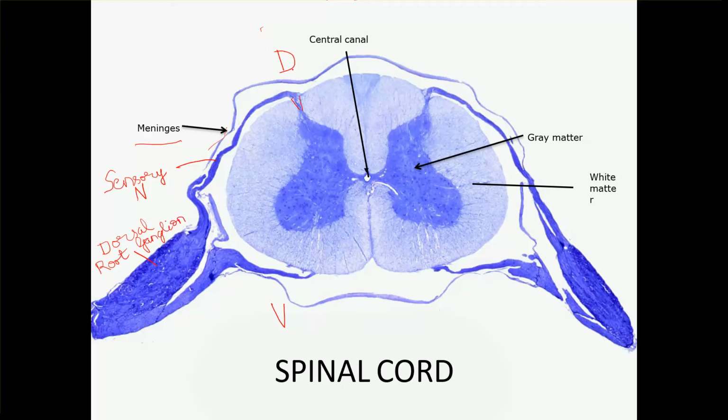Okay, so once it enters the dorsal horn, there are interneurons in between them, which will communicate or synapse from the sensory neuron to the motor neuron, right, over here like this. And then the motor neuron or the efferent fibers start from here, from the ventral horn cells. So from here will be the beginning of the motor nerve, which is efferent.